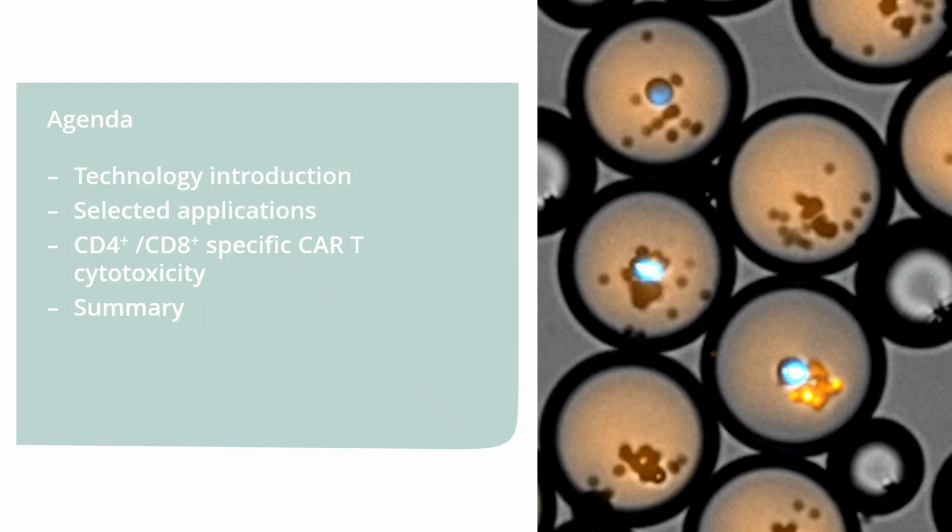Before I begin, let me just provide a brief outline of my talk today. I thought I'd start with a technology introduction and then give you a couple of selected applications of how you can utilize a single cell platform like Xdrop for performing a functional analysis, before really shifting to talking about today's main topic, which is CD4 and CD8 specific CAR T-cell cytotoxicity. And then finally, I'll wrap everything up in a brief summary.